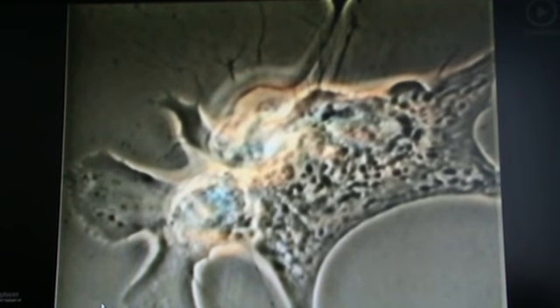And finally, the cell on the right of the picture ceases its activity. All the cells detach themselves from the cover glass into the nutrient fluid during the course of their deterioration. The whole process is equivalent to an infarction or an in vitro heart attack, and was filmed with the help of the Ergonome microscope and the Aldrich chamber.